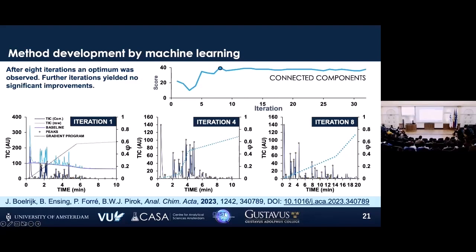Side note, incredibly important things like peak detection and background correction, I'm completely ignoring all of them, acting as if it's very simple, but it's not. So just want to be fair there.